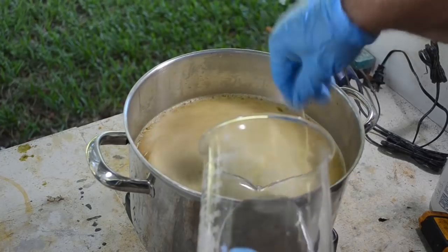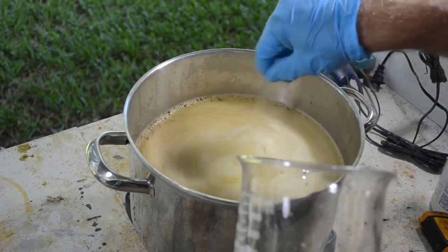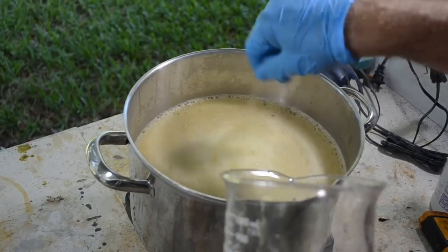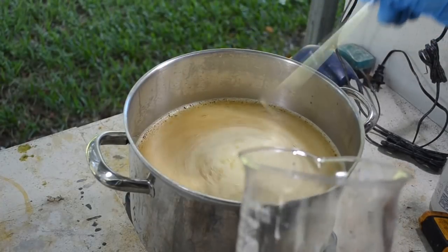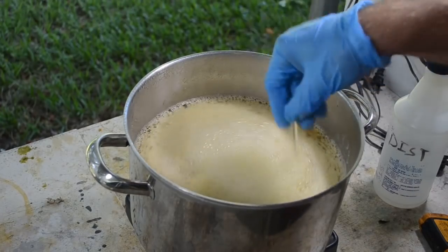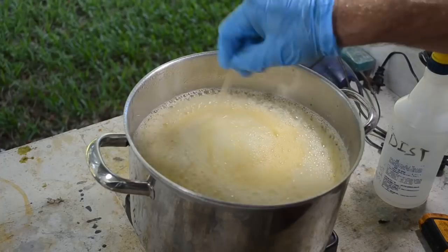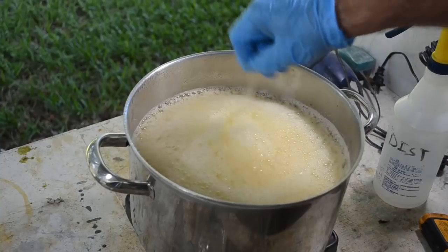And just keep measuring the pH until we get down to my target of between 2.5 and 3. Going to take a while with this much liquid. But I'll be back when we get close. I think I may have said earlier that the closer you get to the target pH, the worse the foaming is with each addition of acid. Yeah. It's getting pretty bad. So I'm going to just test the pH again.